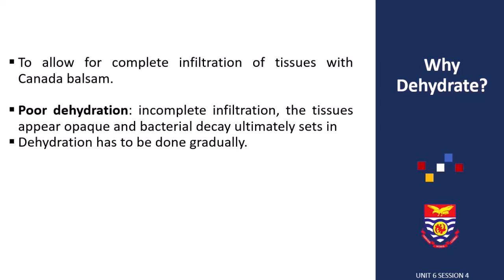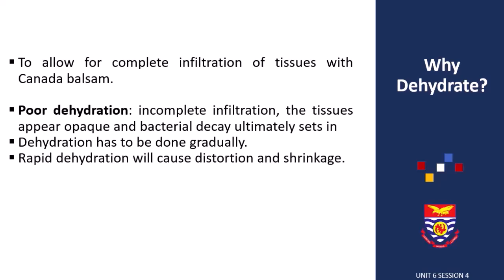Dehydration procedure, that is removal of water, should be done gradually, and there should be sufficient time allowable for the complete extraction of water. And if it is done rapidly, it will cause distortion and shrinkage of the tissue by setting up violent diffusion current, especially on delicate tissues.